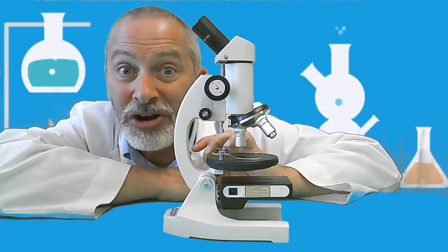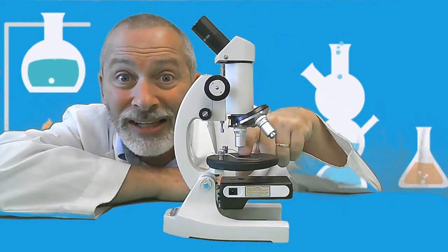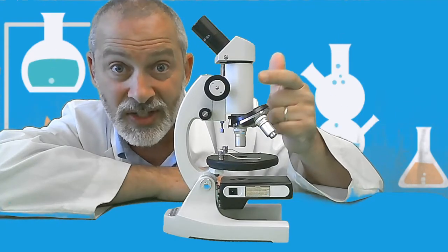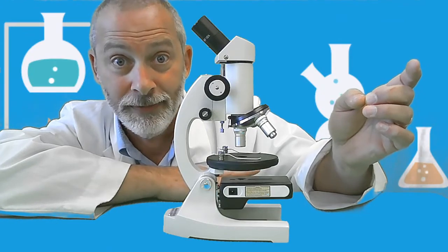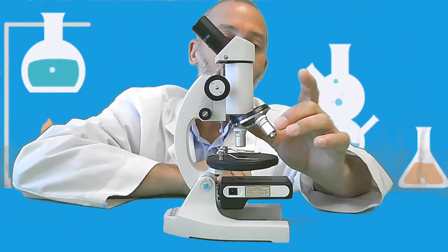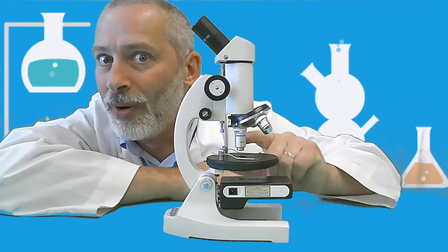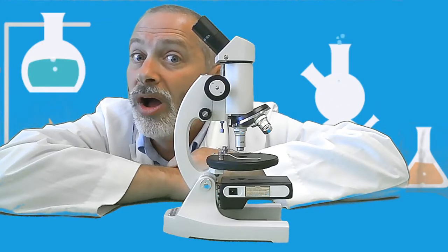Think of that in reverse. Think about how much we're magnifying itty-bitty tiny little things that you can't see with the unaided eye. We need a microscope in order to magnify these things to see the invisible world of animalcules, as Van Leeuwenhoek said. So let's go to our last one here. Our high-power objective lens has a magnification power of 40.